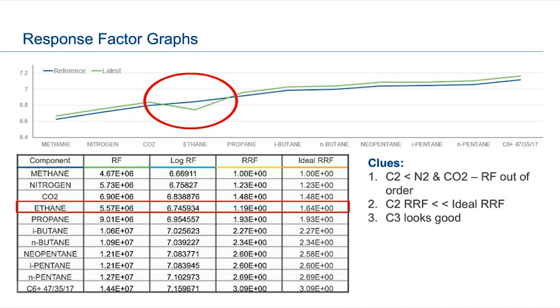But I'm looking at the other components, and I can see that propane, which would be when we do the valve timing, ethane is split from the propane. That's propane. That's the shift of the valve. But propane looks fine. So my ethane isn't short because I put more into the propane, or basically I shifted too early. So that tells me it's something more specifically to the ethane.